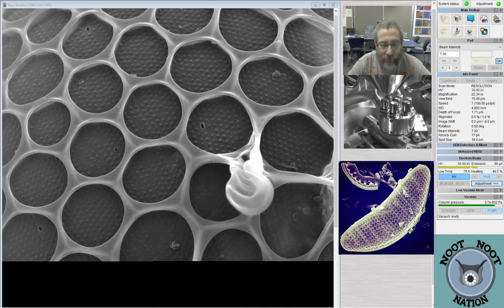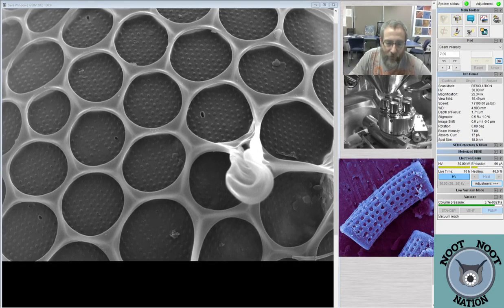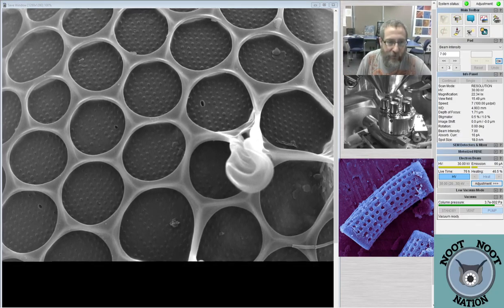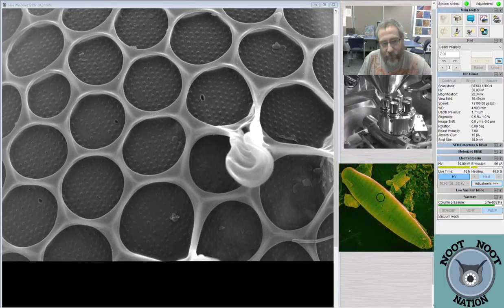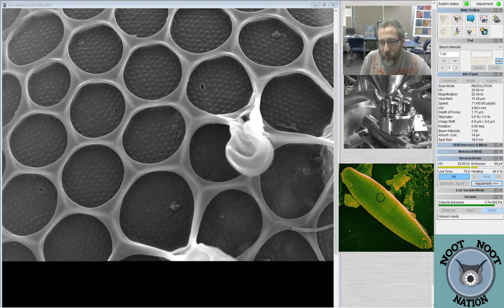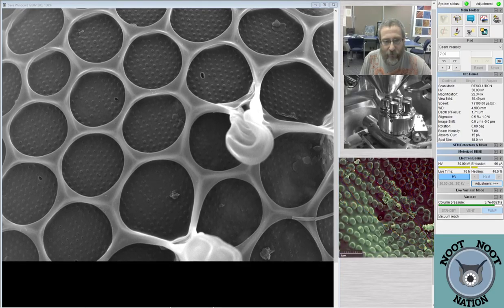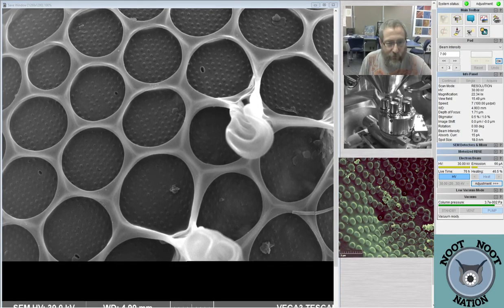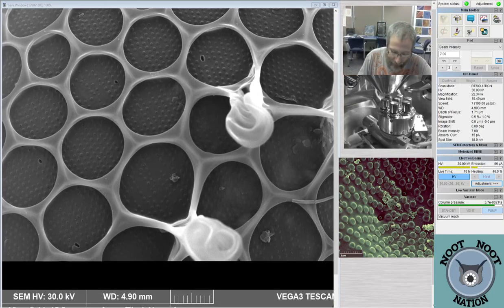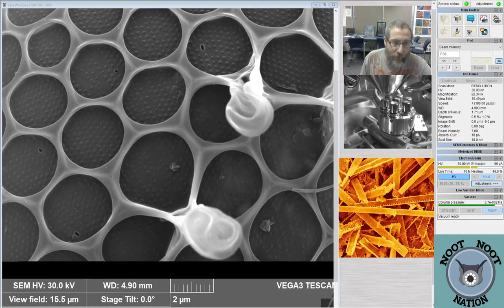So a scanning electron microscope actually scans over the surface, and it's putting the information in at each place where it scans. And where it scans a little bit more slowly, it increases the resolution of the image. So it doesn't have anything to do with the size of the data. It's the rate at which the machine operates, basically. So if I had a supercomputer sitting here next to it, it would still produce it at the same rate. That's how fast it scans. And it's building the image pixel by pixel.